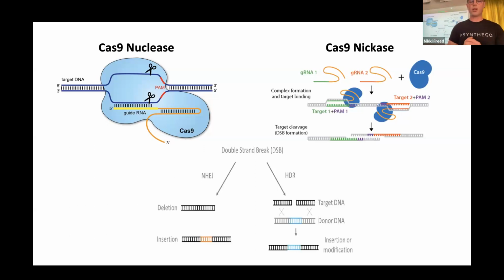There's non-homologous end joining, which induces small insertion and deletion events, but there's also homology-directed repair, which is our primary pathway, which is used to incorporate specific edits. And this is what we use to correct the patient mutations. And something key I want to emphasize here is that if we're editing 100,000 cells, that's 200,000 alleles. So we potentially have 200,000 editing outcomes in a bulk DNA. So you'll see why that's important coming up.